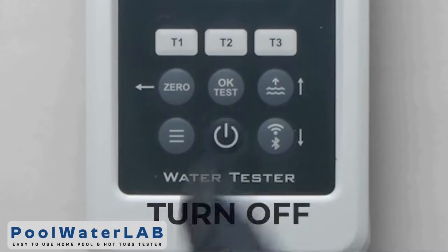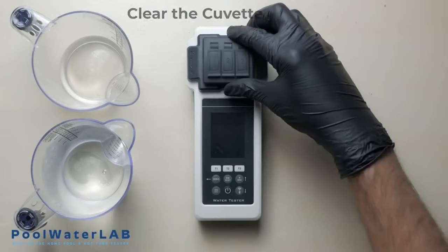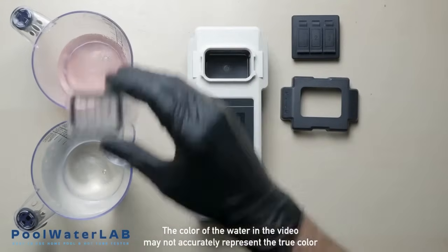To turn off the device, press and hold the off button. Run other tests if necessary. After finishing the test, obligatorily rinse the cuvette with clean water.